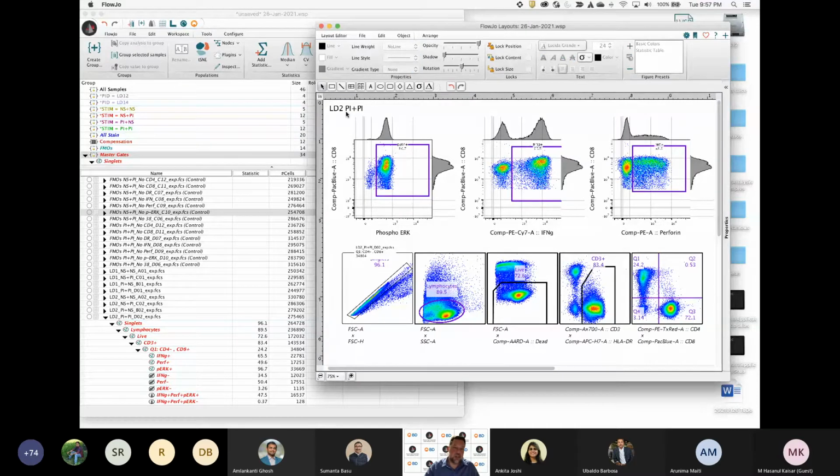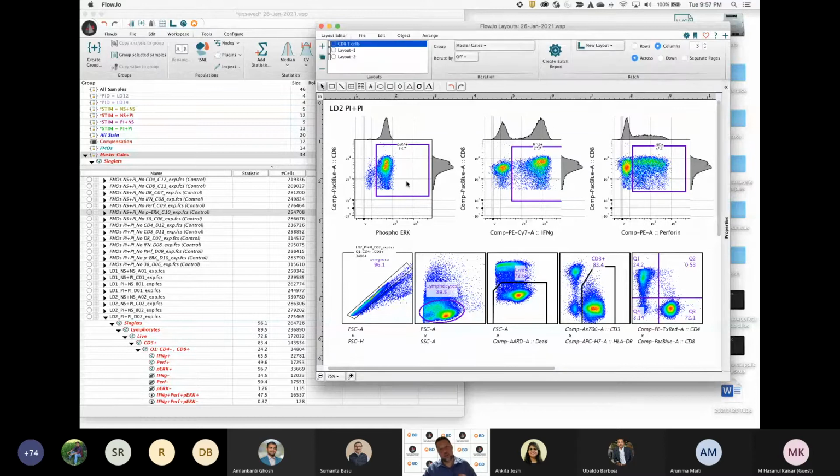Now, the beauty of this is when I actually print this out, it'll be up there as a label, and I can show my boss and they can be like, oh yeah, I can see what you're working on, what you're working with.